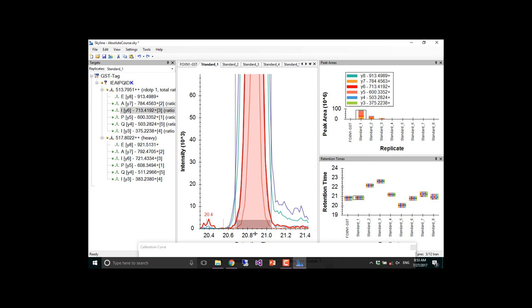When we're looking from the top, you may think it looks too wide, but right now I'm wondering if maybe that's too narrow, because I don't know what the background really is here. Hard to say, but that might be higher than the true background. But there is some area that gets subtracted.